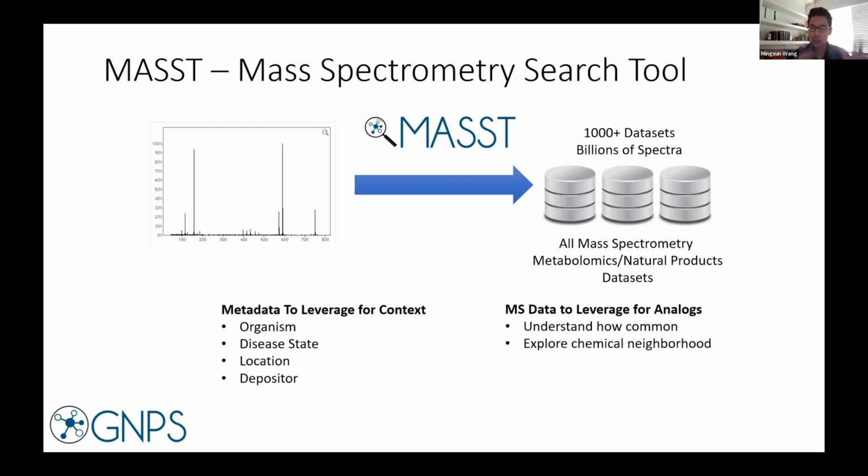These are the two areas where people have started using MASST, at least that's what we've seen so far. But it's a pretty general tool. People have been pretty creative with BLAST, and we look forward to how people will use MASST. Those are the most obvious deliverables if you use the actual tool.